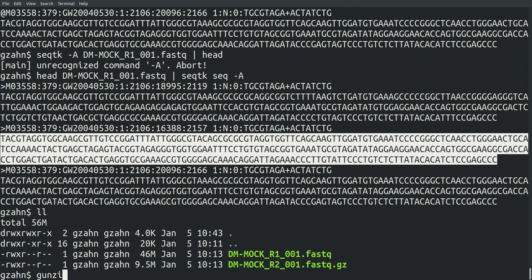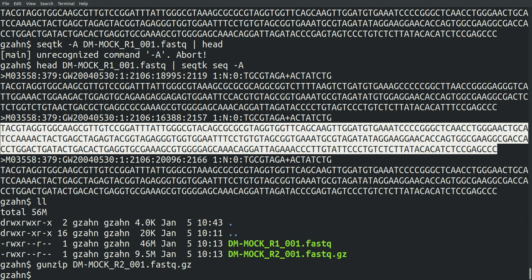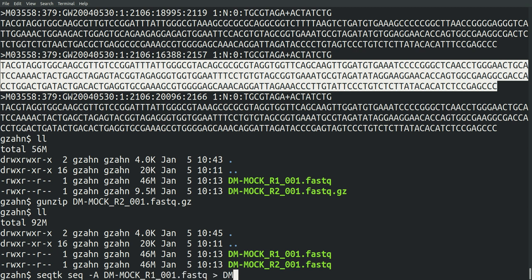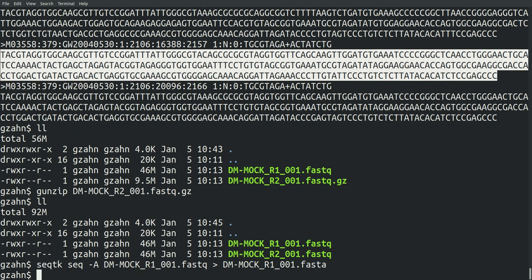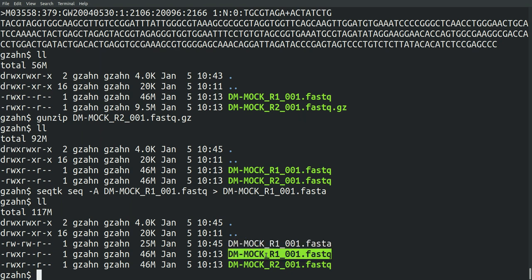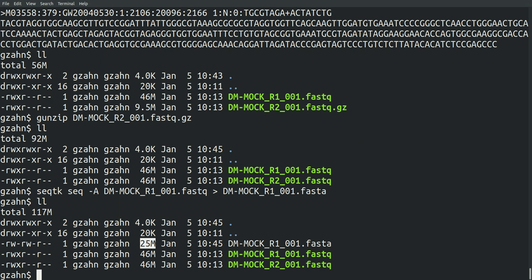So let's say I wanted to save a FASTA version of each of these. First, I'll unzip that reverse read. So I've got my FASTQ files. Great. I can say SeqTK seq A, DM-MOCK our first read, and then just pipe it right into DM-MOCK R1. Go back and change that FASTQ to a FASTA. So now I've got a FASTA version. It's just removed the quality scores. You can see that it takes up about half the amount of space, which makes sense. It's not duplicating all that information with quality scores as well.